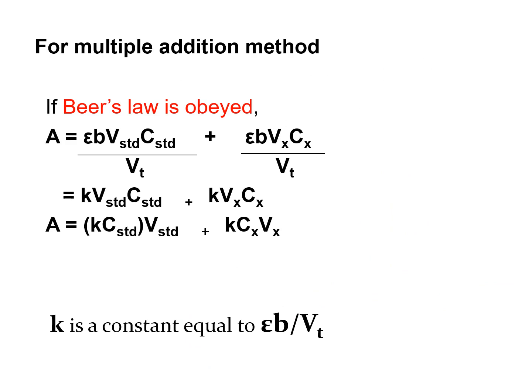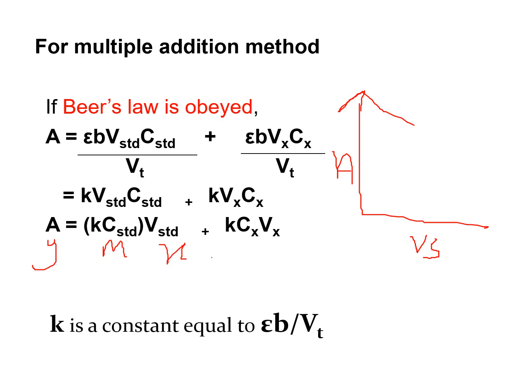Okay, so tadi macam mana kita boleh dapat volume of standard versus absorbent is by using this formula lah. Okay, by using this formula, A ni adalah Y, mx, with standard adalah x plus c. Okay, so that's why kita dapat plot macam ni. So kita just plot lah. Kadang-kadang dalam soalan dia dah bagi plot.